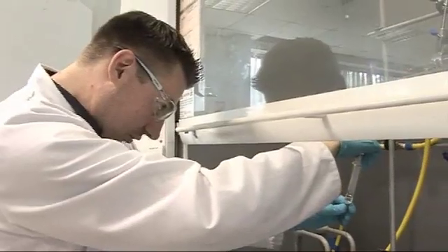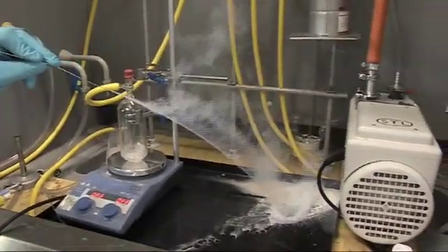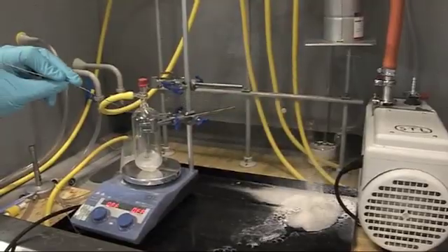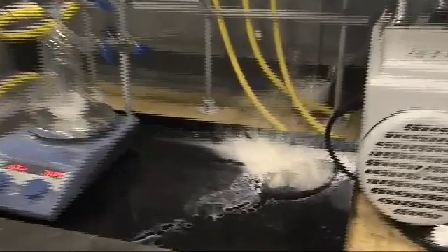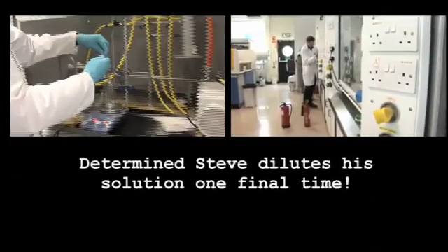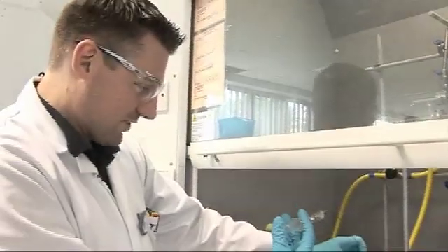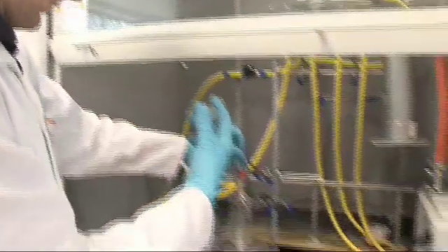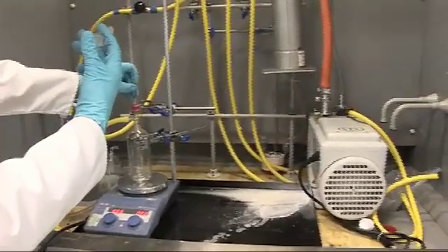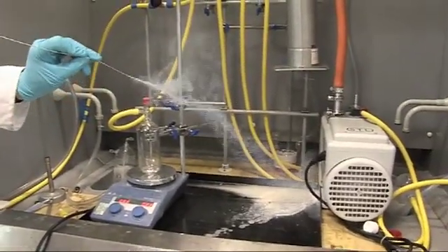It doesn't feel any more dilute, which is slightly worrying. This is after hopefully getting rid of all of the hexane solvent. We'll now see if we can get this blue flame that I've been promised in textbooks. So here we go... Nope.